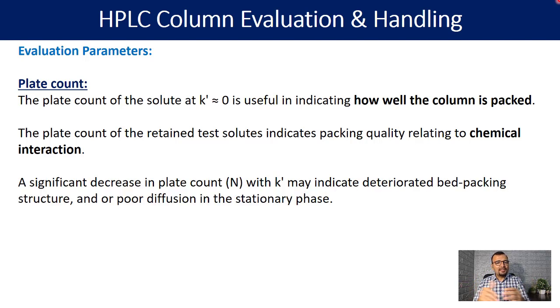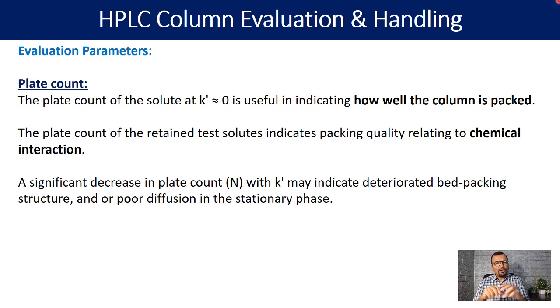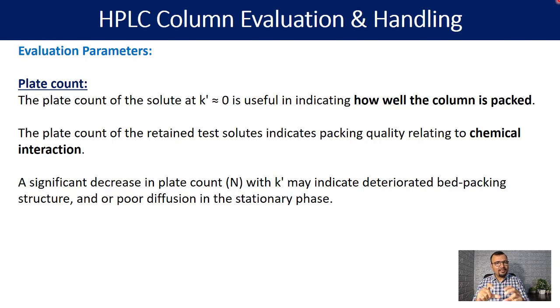A significant decrease in plate count N at higher k' may indicate a deteriorated bed packing structure and/or poor diffusion in the stationary phase. Diffusion is an important parameter for efficiency — the number of interactions of your compound with the stationary phase. If diffusion decreases, your plate count or number of interactions will also decrease. That is the intention of having late eluting compounds in your performance mixture.